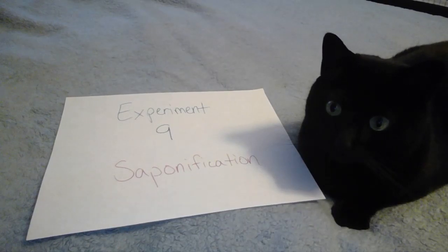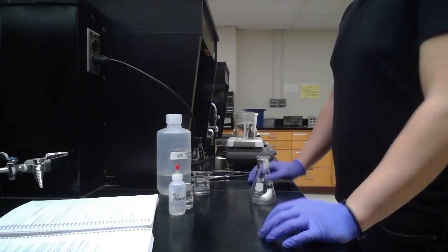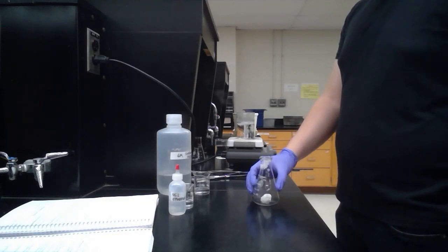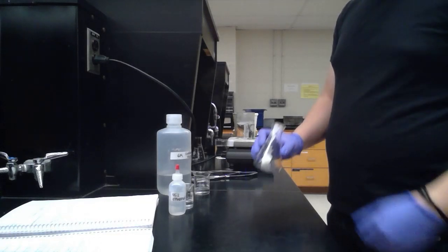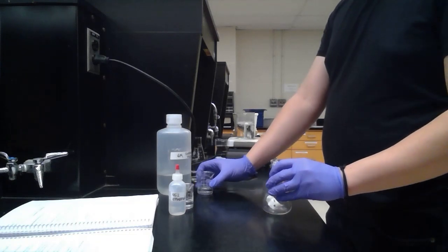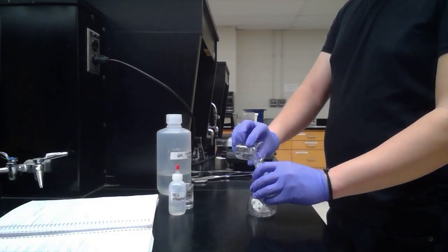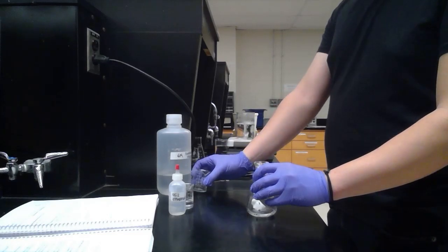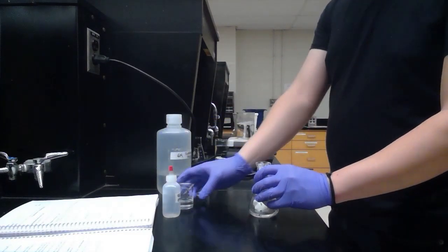Experiment 9, saponification. Here we have 6.31 grams of lard, and we've already added the boiling chips. Now we're going to add 6 molar sodium hydroxide and 95% ethanol.